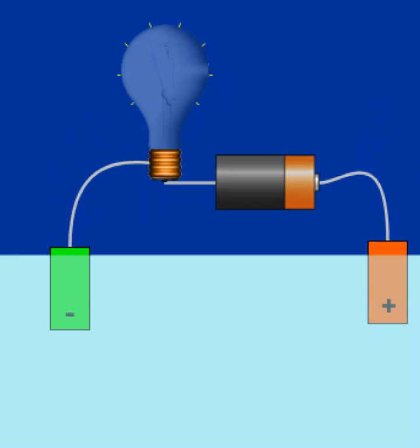And I get, on that light bulb, do you see those tiny little yellow lines? That's showing us this would be a very dim light. And honestly, it might depend on how much voltage you have, that you might not see any light at all on this one. Tap water does have some ions in it, like magnesium and calcium ions, that could conduct a current, but they're very dilute. There's not very many of them.